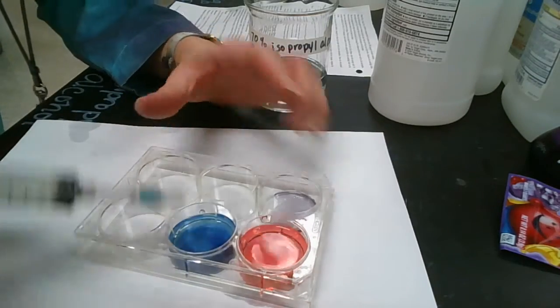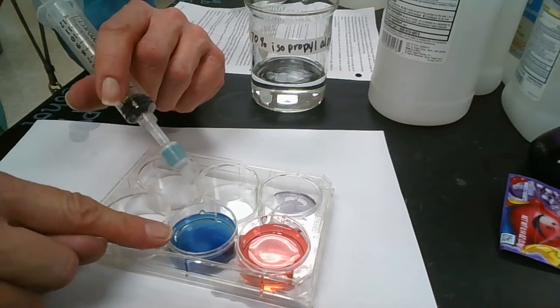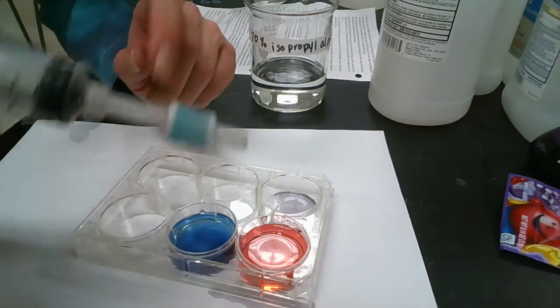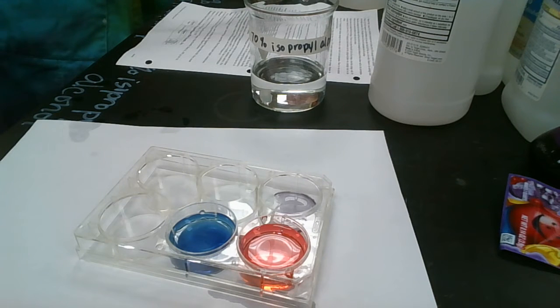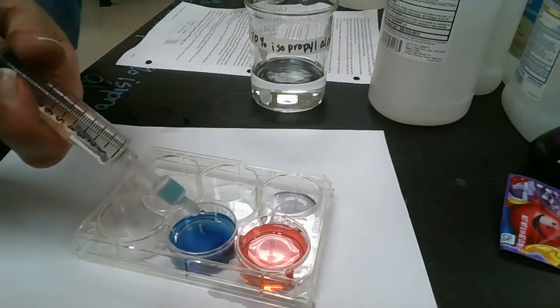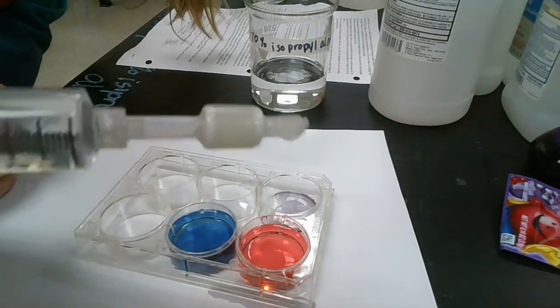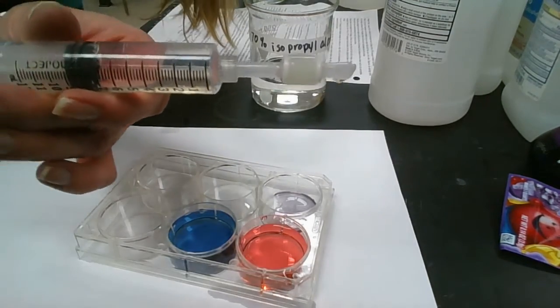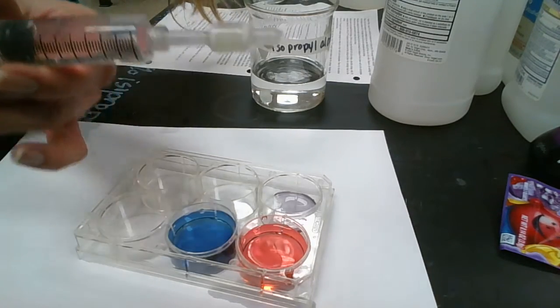So here was the 5% isopropyl, which brought off the red dye, and the 25% isopropyl alcohol really brought off the blue dye. Now there's a tiny bit of blue dye left on there. I can try to get that off with some more 25%. There, it looks like I've gotten pretty much the rest of the blue dye off the column because I don't see any more on it right now. And the column looks pretty clean.